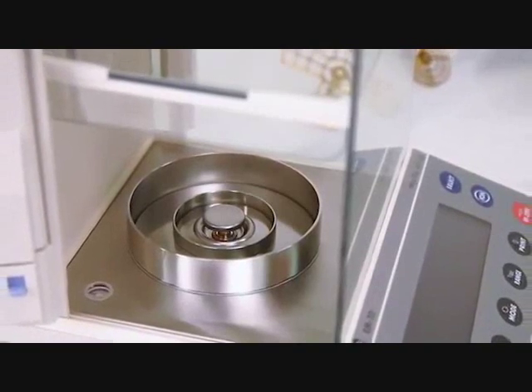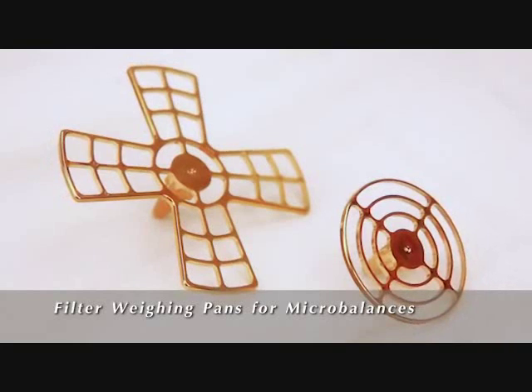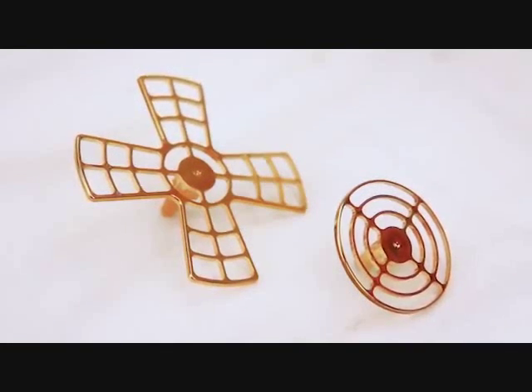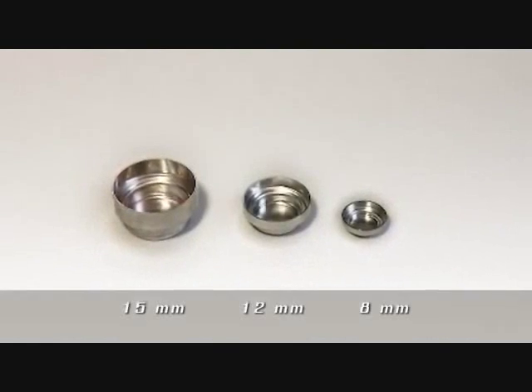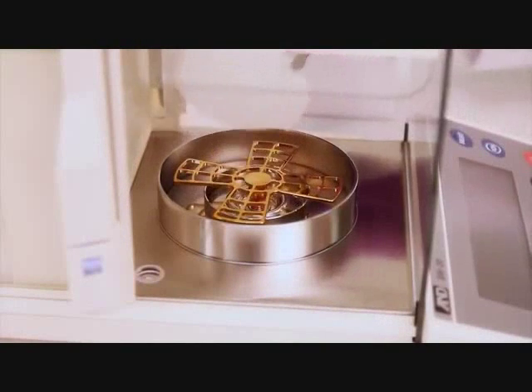This gives A&D's microbalances large weighing chambers. The BM20 and BM22 also come with two extra pans specially designed for filter weighing, and a supply of disposable weigh boats in three different sizes.